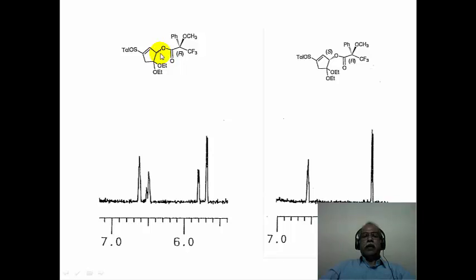Similarly, this hydrogen, which is bearing the ester functional group, also comes as two isomers. So integration of this peak essentially tells you how much of the R alcohol and how much of the S alcohol is present in the system, as far as the enantiomeric enrichment or enantiomeric excess is concerned. In the case of the pure RS isomer, there is only one enantiomer that we are talking about, so it gives only one peak. So this peak, which is coming around 6.5 or so and 6.6 or so, corresponds to this peak here, and this peak here, which is around 5.57, essentially corresponds to the S isomer. So one can assign these tall peaks to the S isomer of the alcohol and the small peaks to the R isomer of the corresponding alcohol.